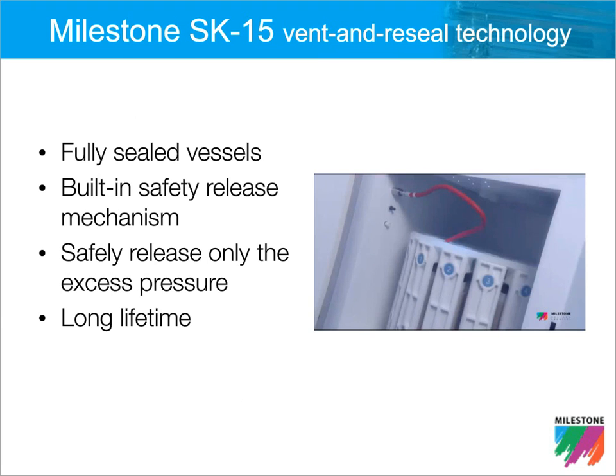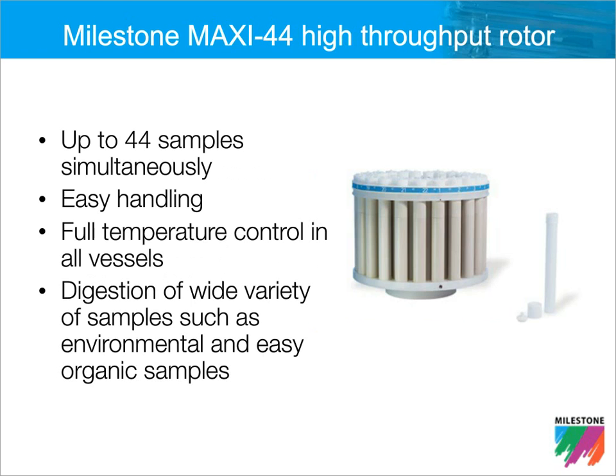So once again, here's just a closer up picture of that SK15 rotor. Okay, 15 segmented positions, and you only run the number of positions that you're going to be using. A general rule of thumb in microwave is that as you increase the number of samples that you're digesting at a given time, the flexibility of that rotor, of those vessels, go down, simply because we don't have the ability to support those vessels at the high temperatures and pressures that are needed.